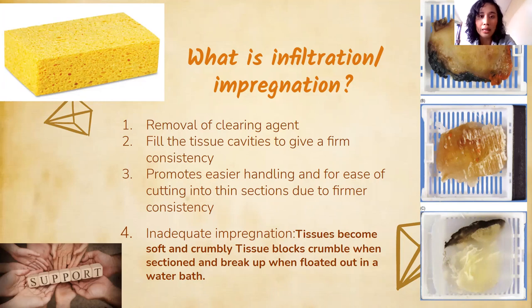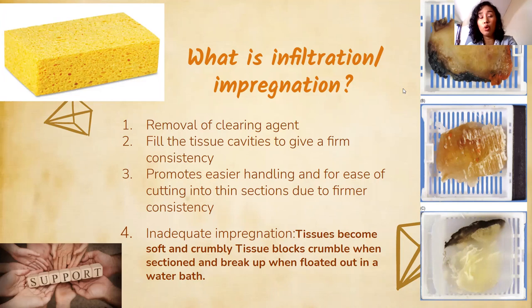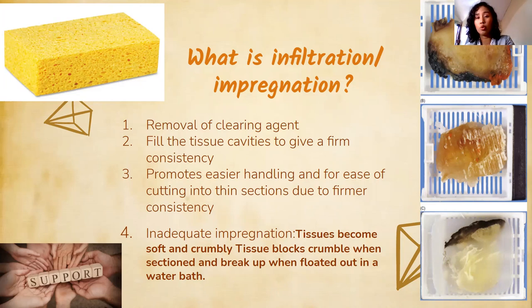What happens when you inadequately impregnate? The clearing agent is not removed, the tissue is soft and crumbly — like cookies falling apart. Tissue blocks crumble when sectioned and break up when floated in the water bath. If impregnation is not done properly, the tissue crumbles, is difficult to cut, and is easily damaged. Once infiltrated with paraffin wax, the tissue becomes firmer. After embedding, it becomes a tissue block.